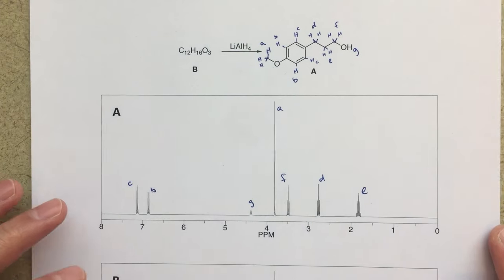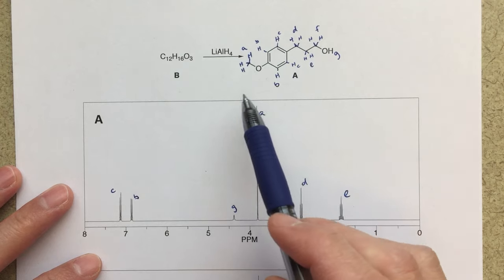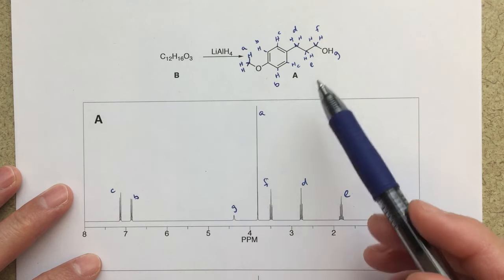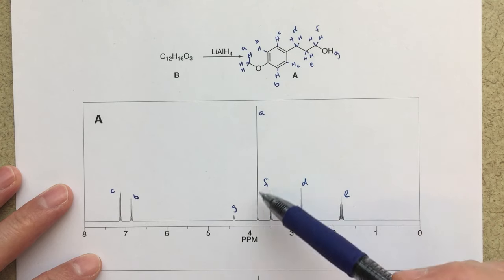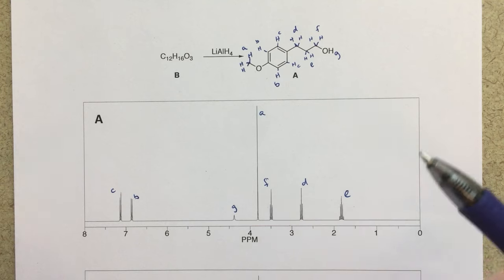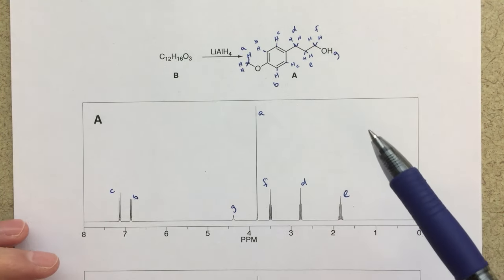So if we go back and sort of try to bounce some ideas off this, I am going to have to come up with a plausible structure for something like this. Clearly our OH is gone, right? We're seeing that that OH is gone in this NMR. We might not necessarily see that depending on which solvent your NMR is taken in. So this is something that's different.